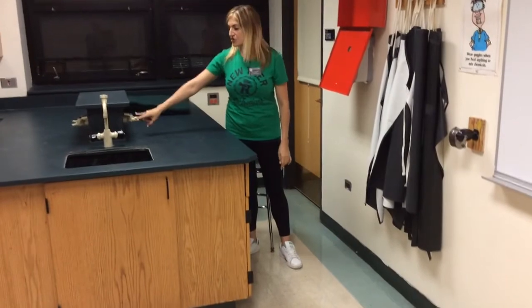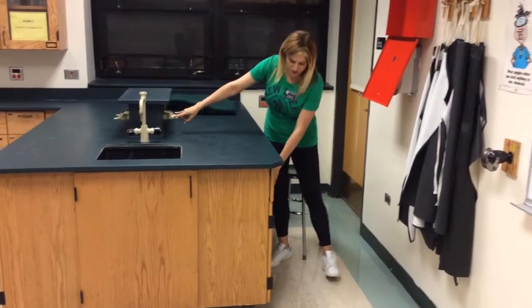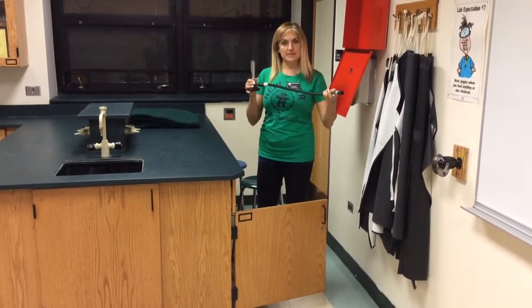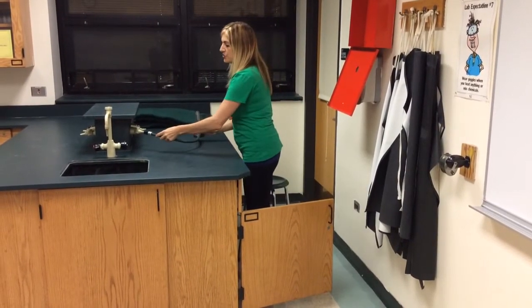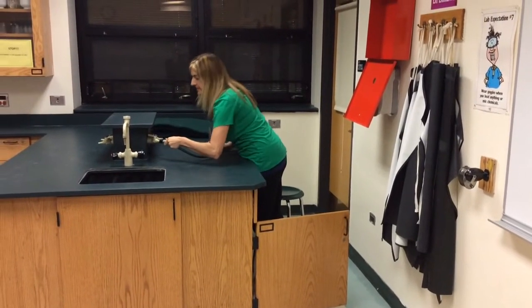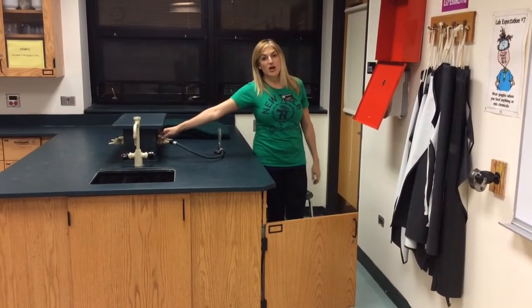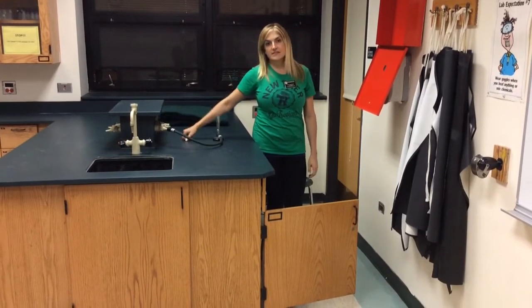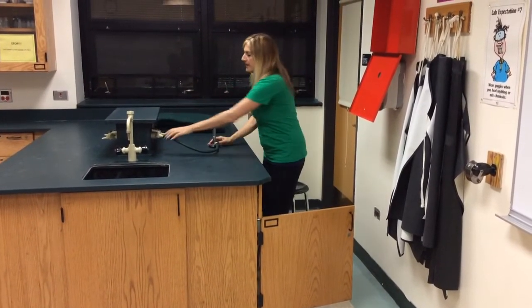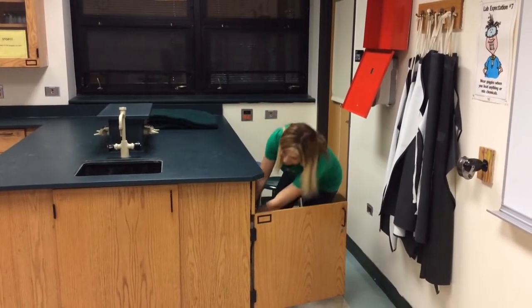This is the gas jet. There's two at every station. You can use whichever one you'd like. Down below here is your Bunsen burner. You would connect the tubing onto the nozzle, and you would turn your gas jet on like this. And then gas, you should hear it and smell it. Okay? Next.